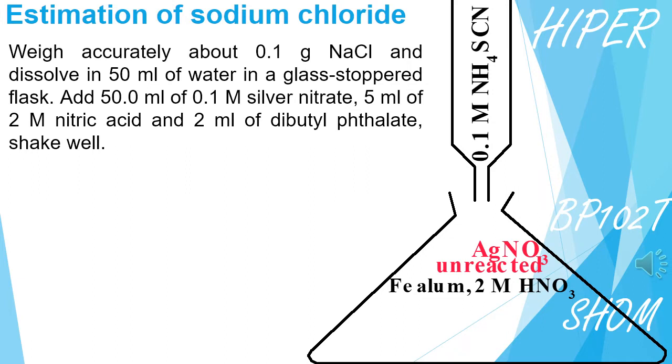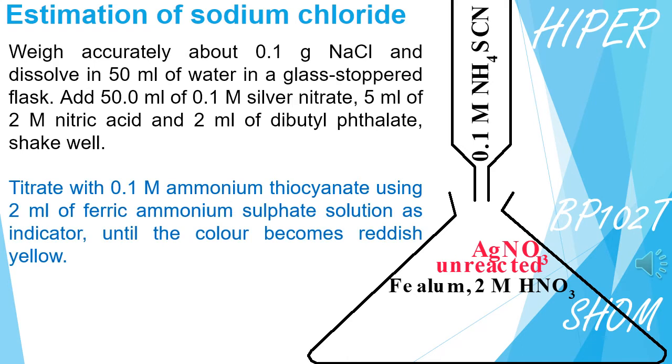We take the first sample of Sodium Chloride in the Conical Flask and mix the reagents. After adding 2 ml of Ferric Ammonium Sulphate, also known as Ferric Alum, to the Conical Flask.